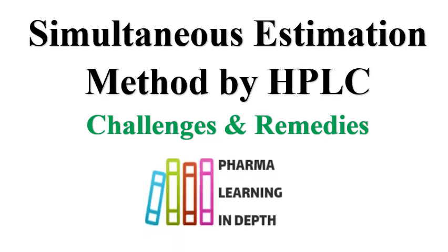The topic for the video is Simultaneous Estimation Method by HPLC, Challenges and the Remedies. Many of the formulations require simultaneous estimation of the components. You might have heard regarding the combination formulations or the fixed dose combinations. These are called as FDC.